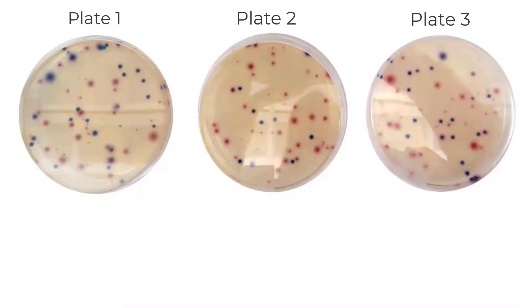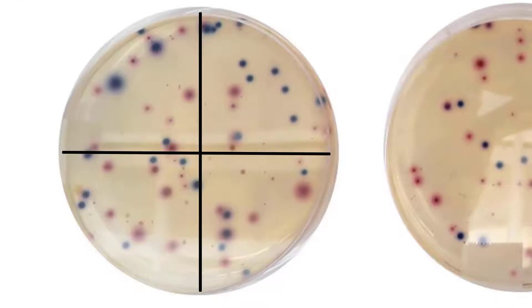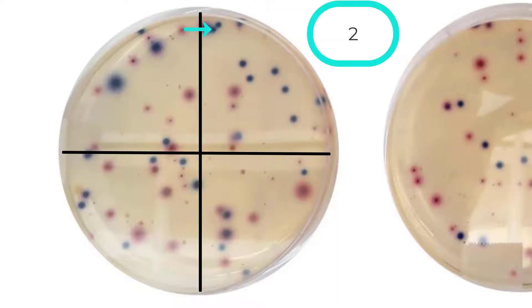We will start with plate one. To help make counting a little easier, we will put our plate on a white piece of paper with quadrants drawn on it, dividing the plate into four sections. Start counting the blue to dark purple dots in the top right quadrant. There are 11 colonies in this quadrant.